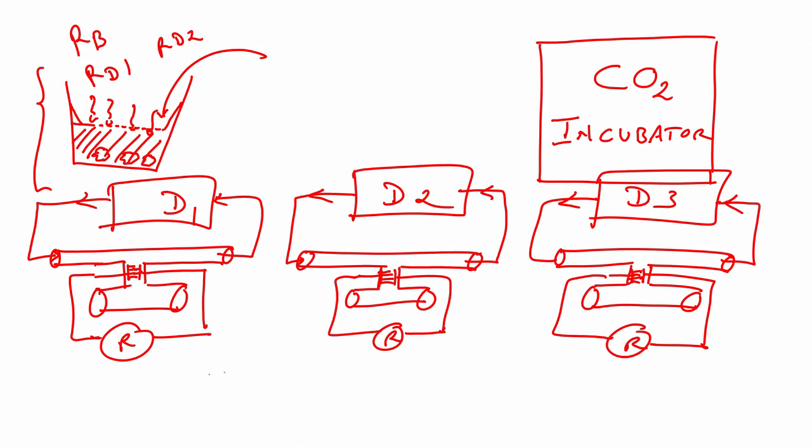What am I looking at? I am looking at initially a resistance value which is RB, base resistance, RB when I load cells with Matrigel. Okay. This is my resistance value. See, without loading any cells, I should have resistance infinite, right? When I load cells with Matrigel, I have a resistance RB, right?